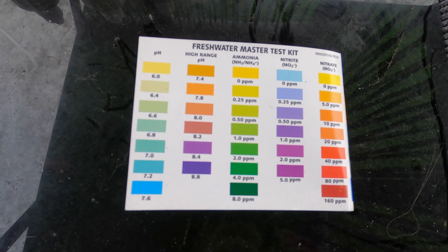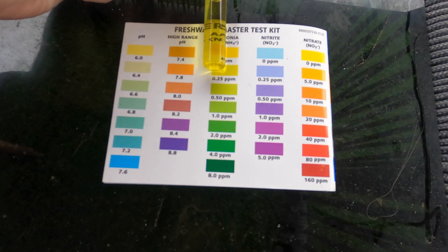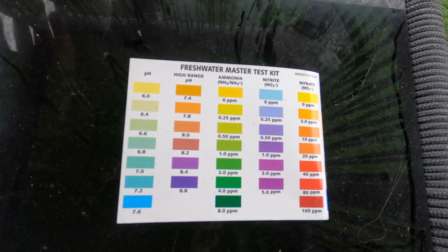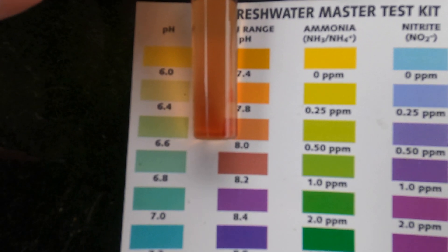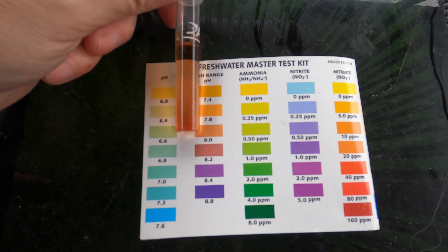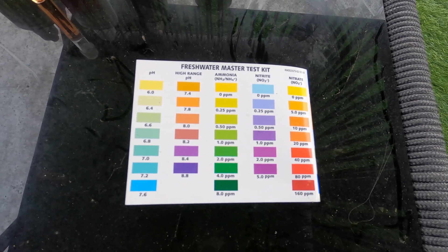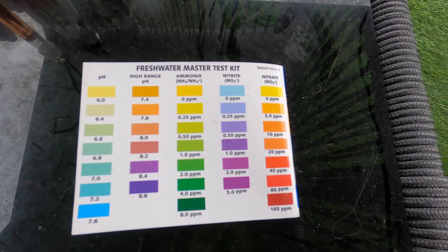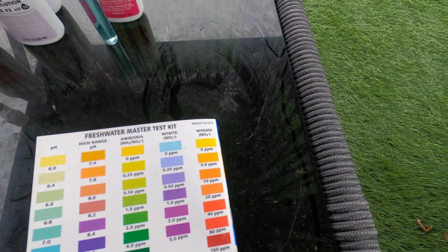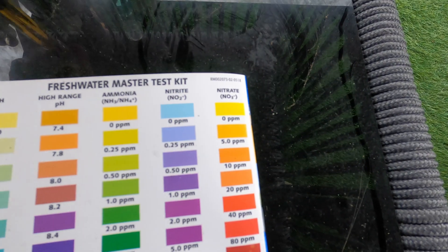Everything's had sufficient time to develop. There's the color chart on the rear of the instruction manual. First up we check the ammonia - it's certainly comparable to the first color which is a really good sign, no ammonia. The high range pH is sitting between 7.4 and 7.8, closer to 7.8 which is a usual reading - that's really good. The nitrite is exactly what we're looking for - zero nitrites, superb. And lastly the nitrates - very little, probably about five parts per million.